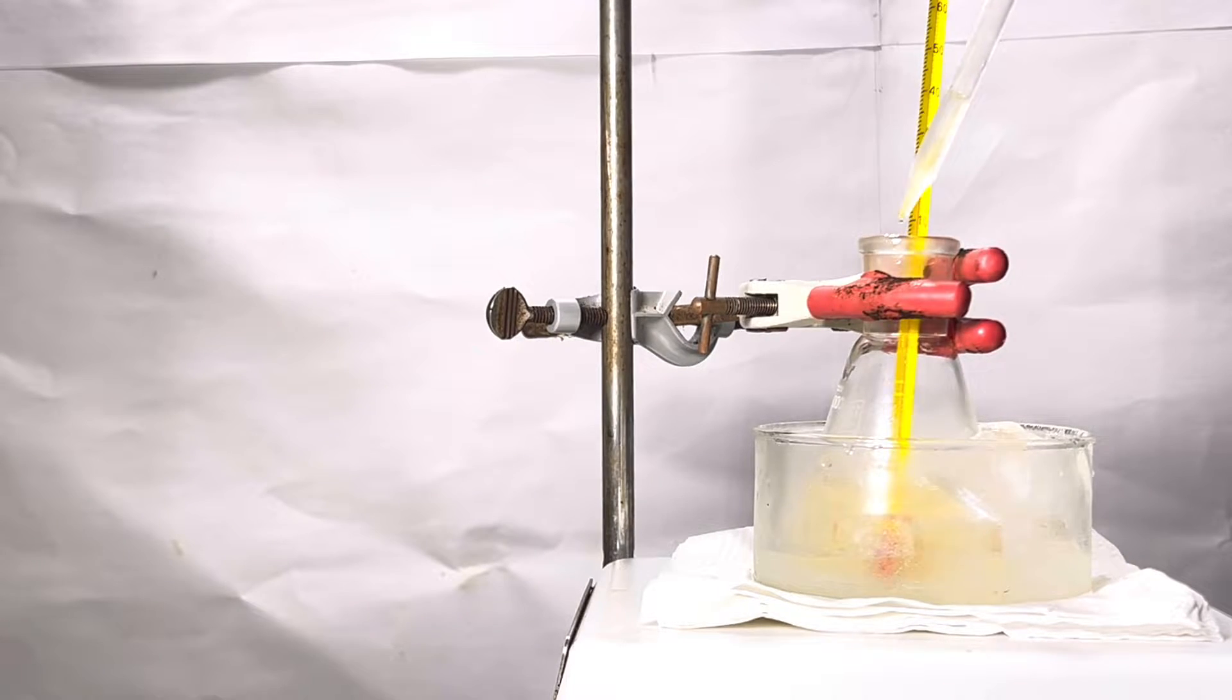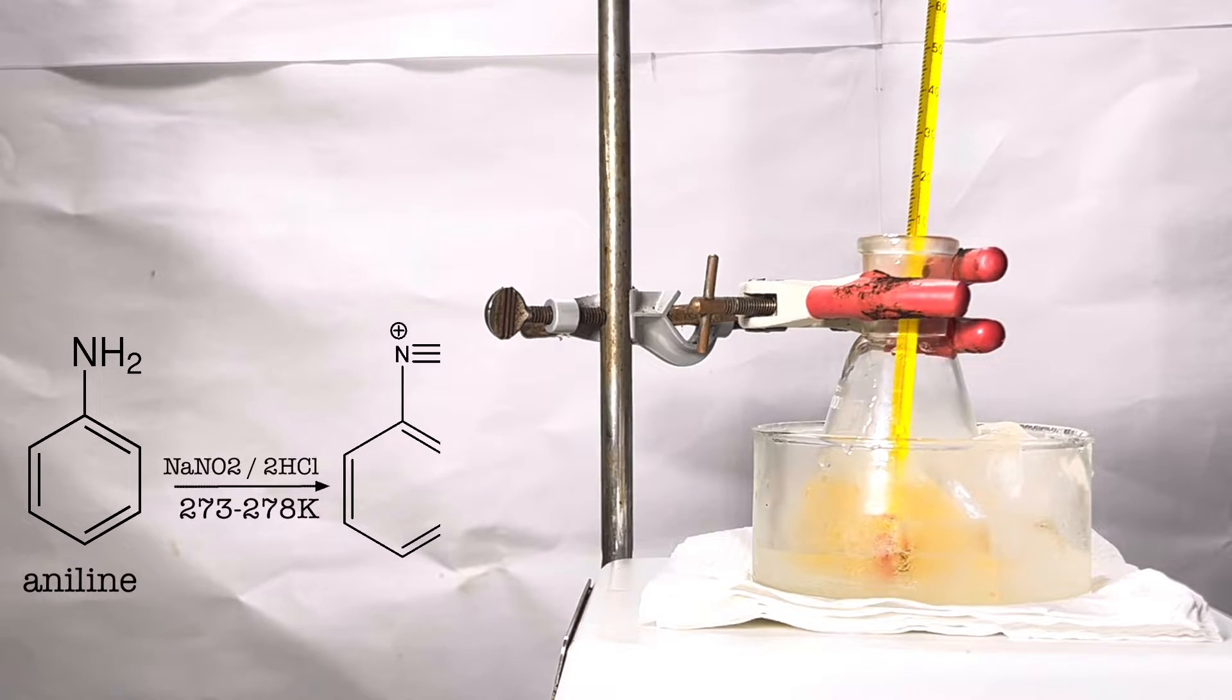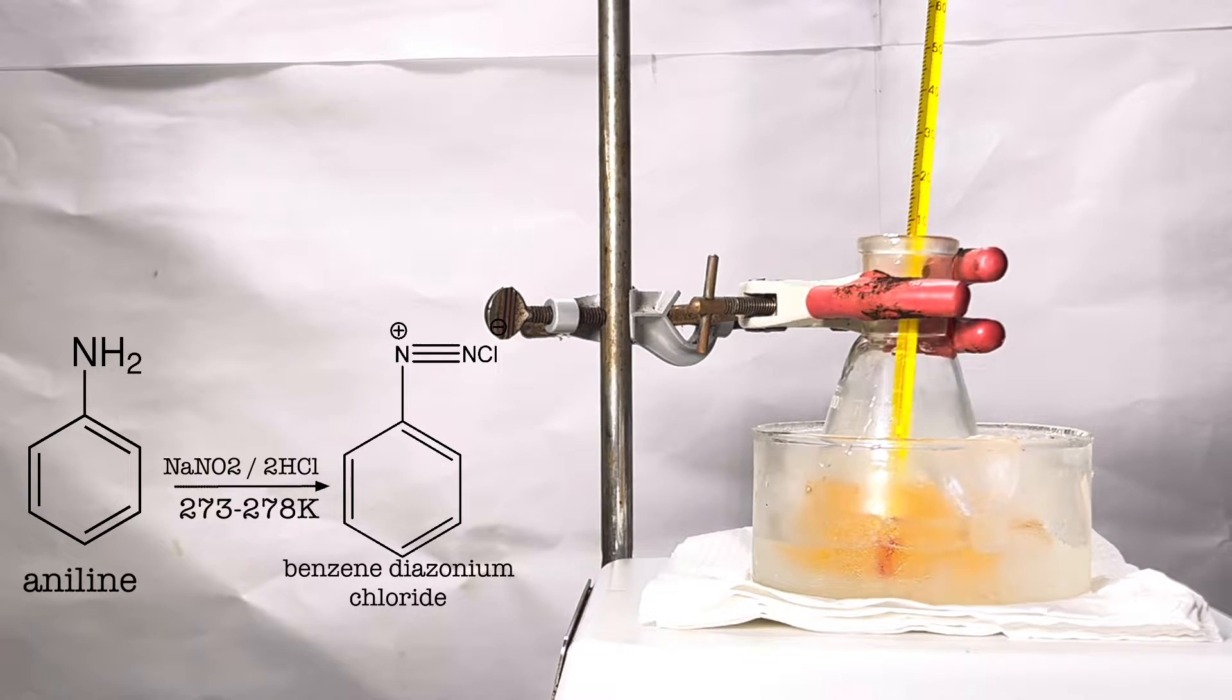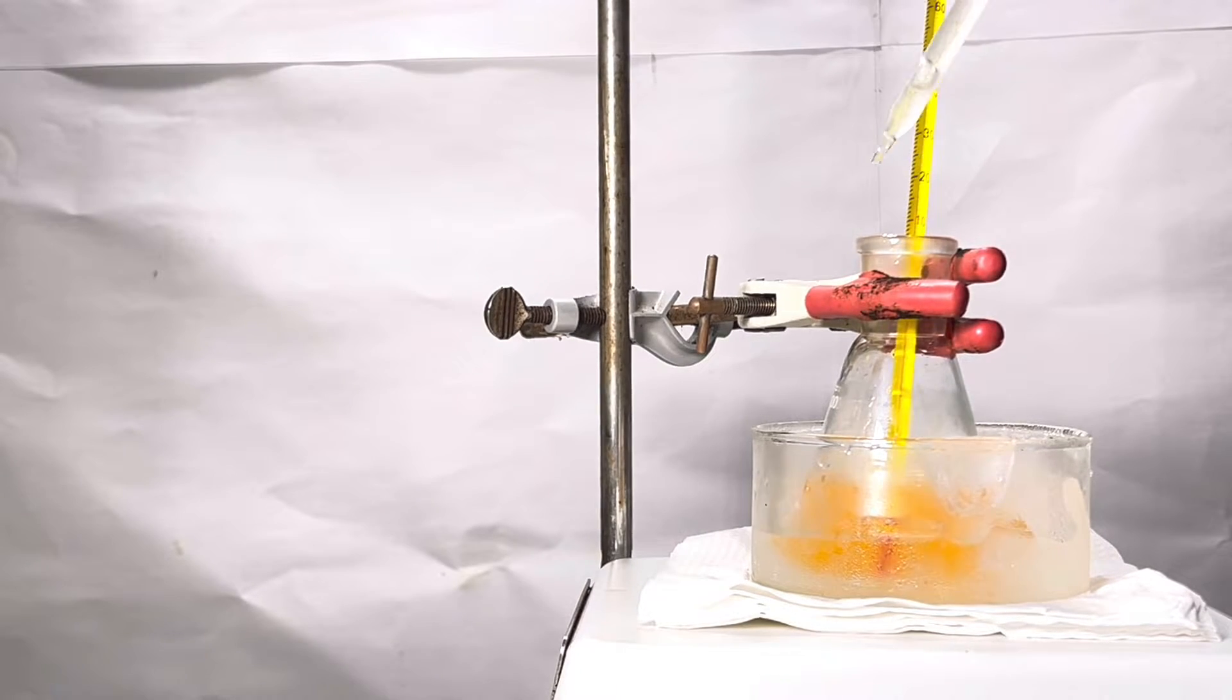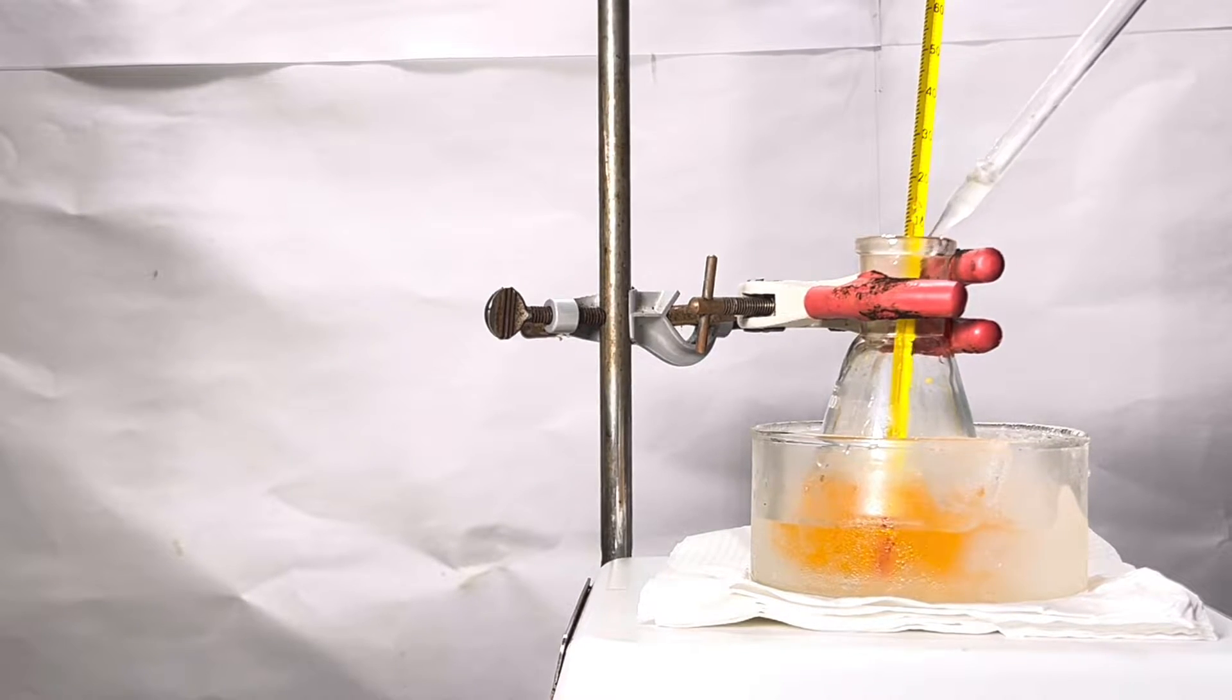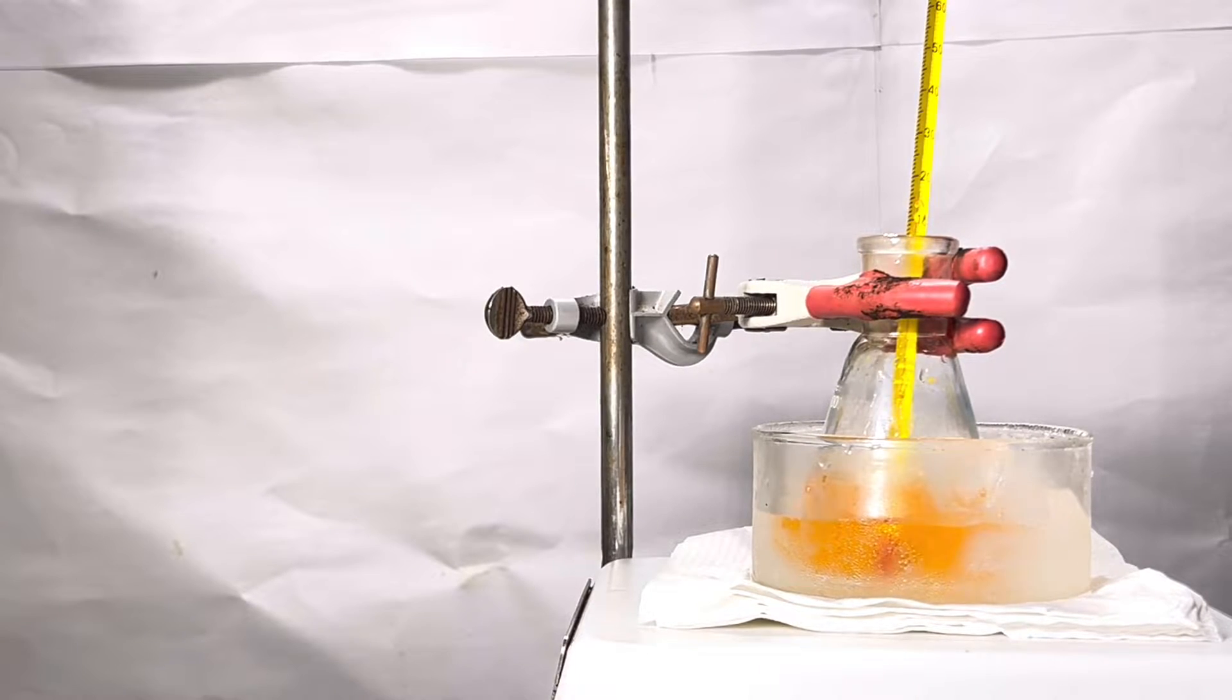At lower temperature, diazotization of aniline takes place forming benzene diazonium chloride. The complete addition of sodium nitrite took about 5 minutes. The color of the solution has turned orange with some dark precipitate floating around. There is no need to remove it by filtration.